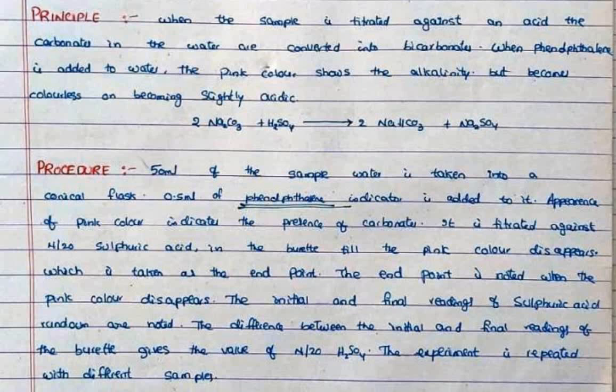Which is taken as the end point. The end point is noted when the pink color disappears.